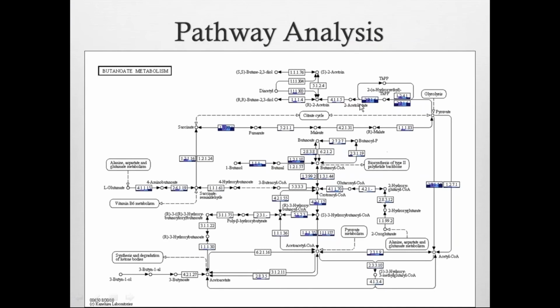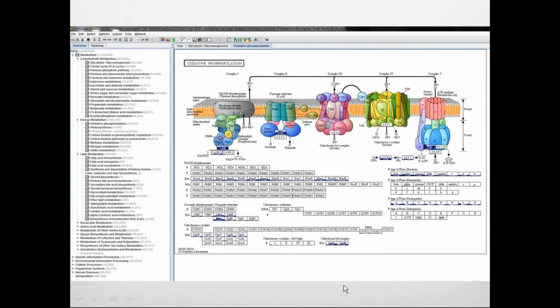And that's what you do here. What you can do here then is reconstruct these pathways. And so this shows you what enzymes and particular metabolic pathways are present and how much is present, in this case, in 4 different samples. So you see some of these enzymes aren't present at all in the sample we're looking at. Other enzymes are present in most of the samples, but for some there's differential expression. Here, like 3 has more of this particular enzyme than others. And then you can reconstruct these pathways in totality by combining all of this different information.